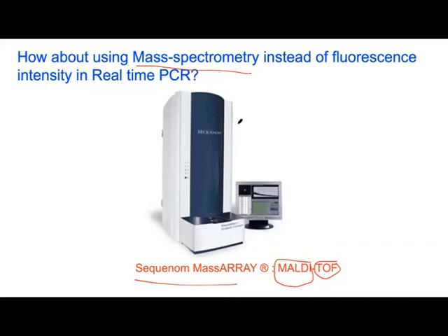But again, here it will become an advantage. If you want to measure in one single tube, you can go up to like 30 to 40 multiplexing in the tube. And people who studied genomics, like SNPs, multiple SNPs, can actually run this plate and get many data from one single tube.